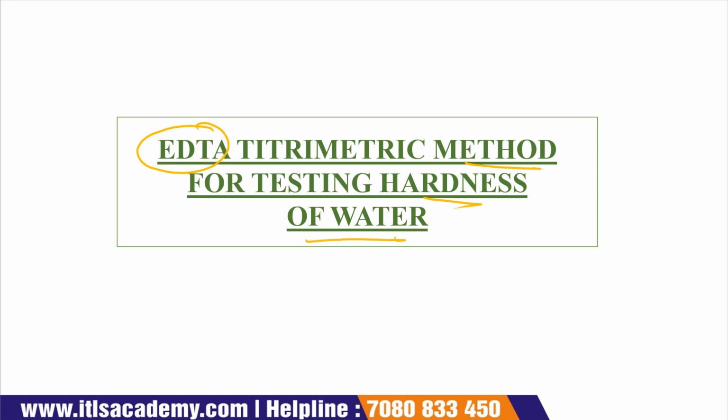What does EDTA mean? EDTA is ethylene diamine tetraacetic acid. Okay, this ethylene diamine tetraacetic acid is used as a chelating agent, and it is used for heavy metal toxicity.